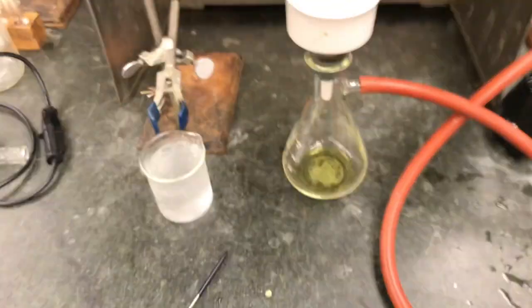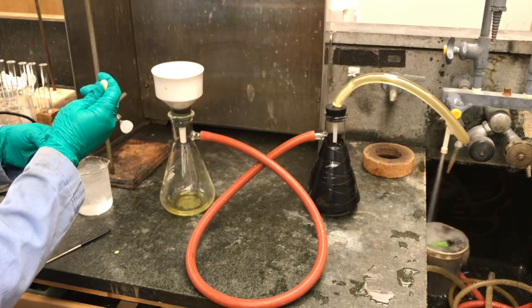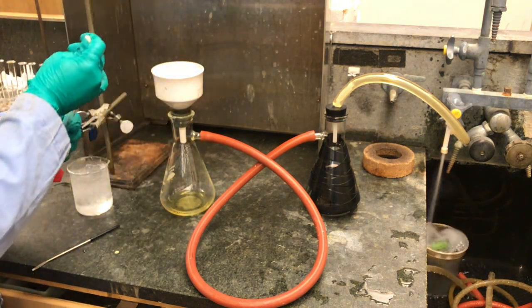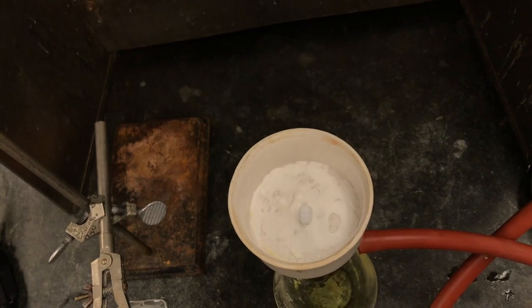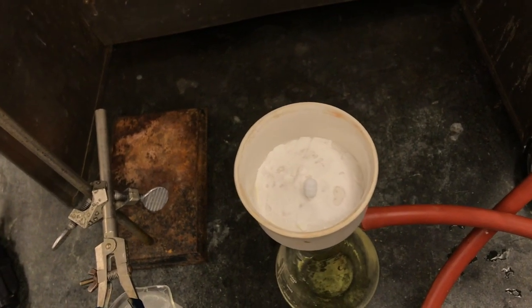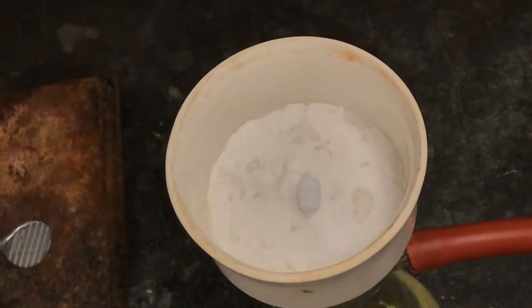So in order to get that out, we're going to use our final 2 milliliters of cold ethanol. And I'm just going to try to get the little impurities. So here's another close-up look, and now you can see that it's pretty much a white solid, and hopefully it's pure enough to analyze.